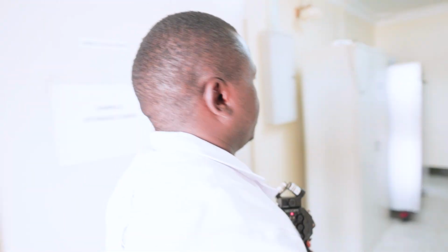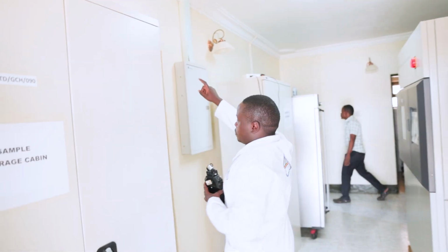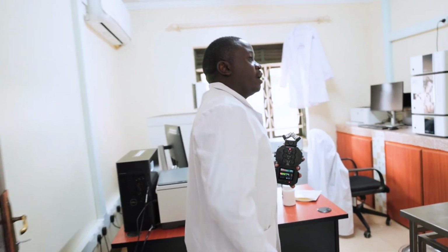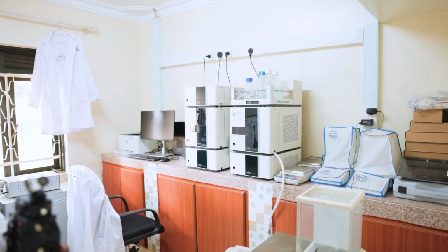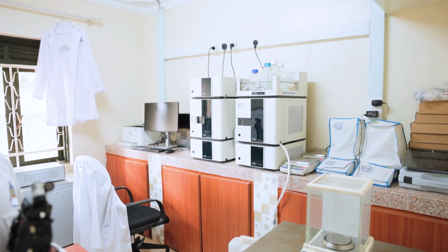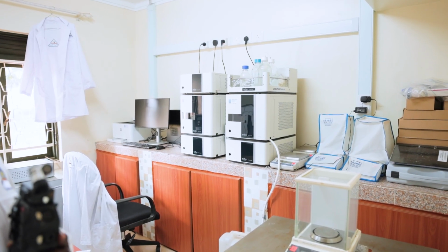This is our general, the open area. And then we have our chromatography room, this one. We have the HPLC. We use this one so much in the analysis of aflatoxins. We are having some challenges with aflatoxin, but this is the one we use to handle aflatoxin analysis.